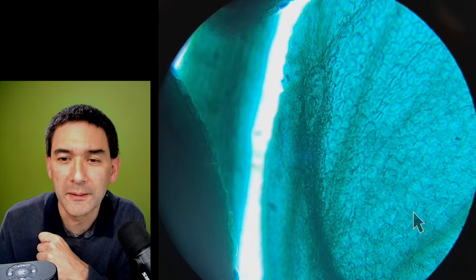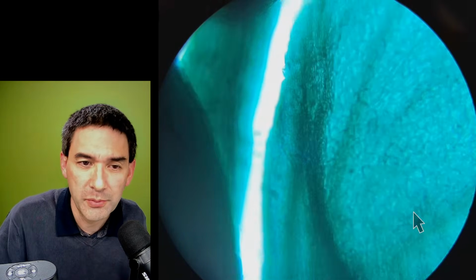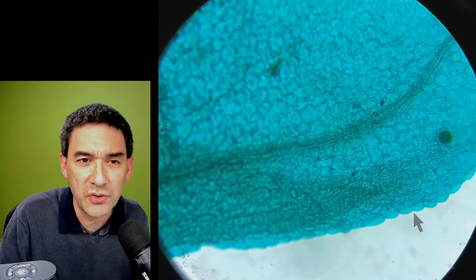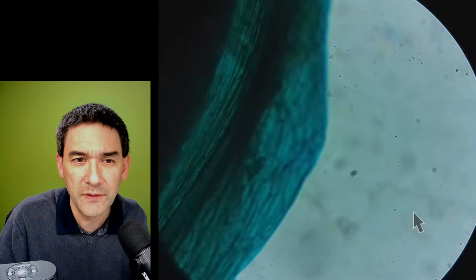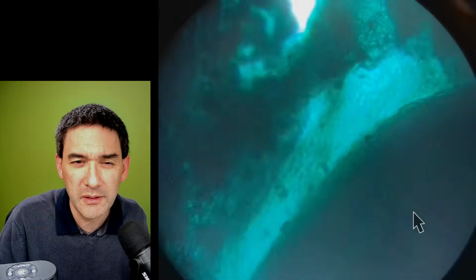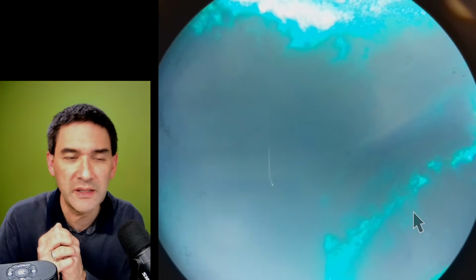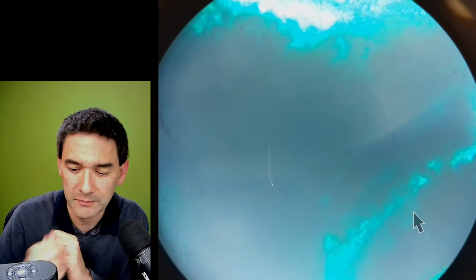Yeah, the propellant. That is the thing. But if it's pure CO2, unless, I don't know, does it actually cool down very much when you use CO2? Because if it's freezing cold, I don't know, then maybe this causes some tensions in the glass. I don't know. You see, that's a typical case of stray light. Yeah. So you know what?